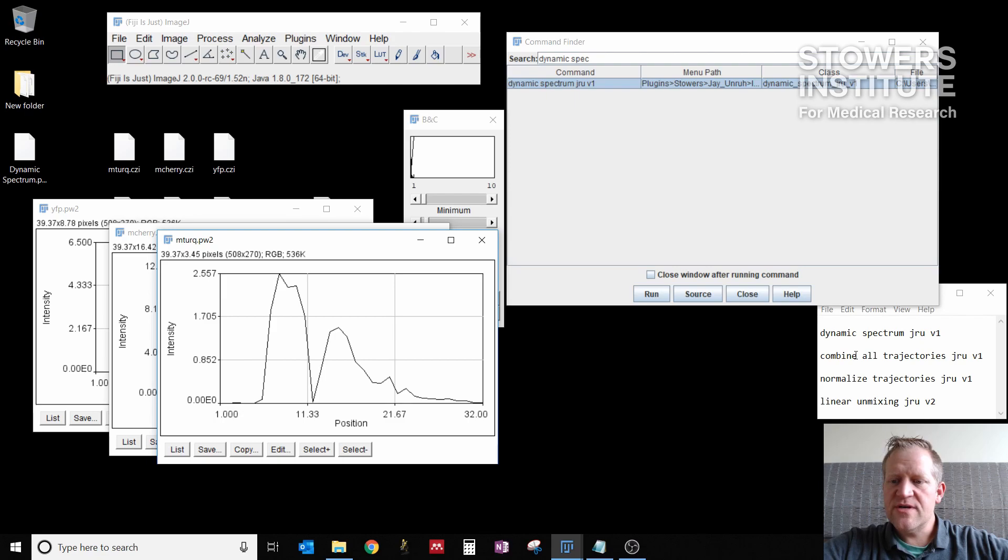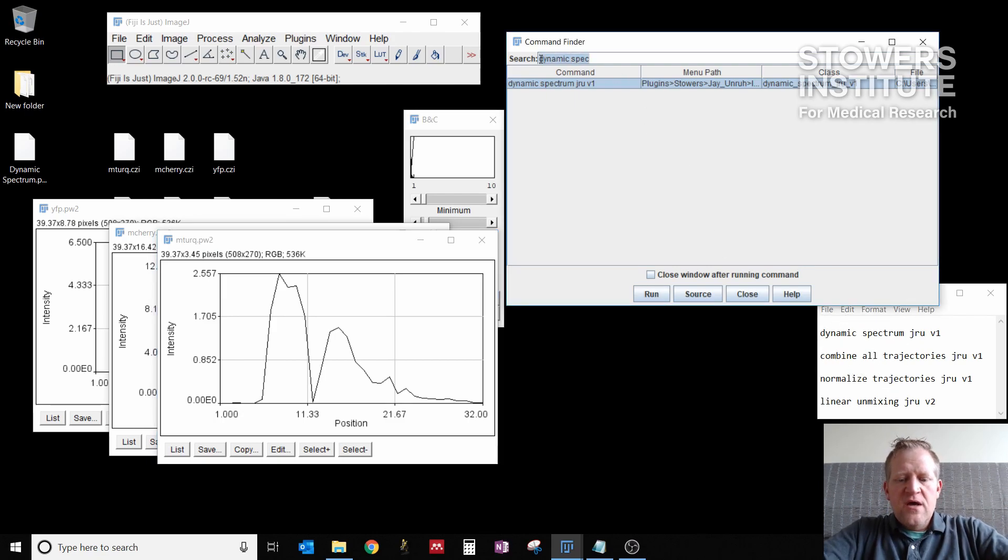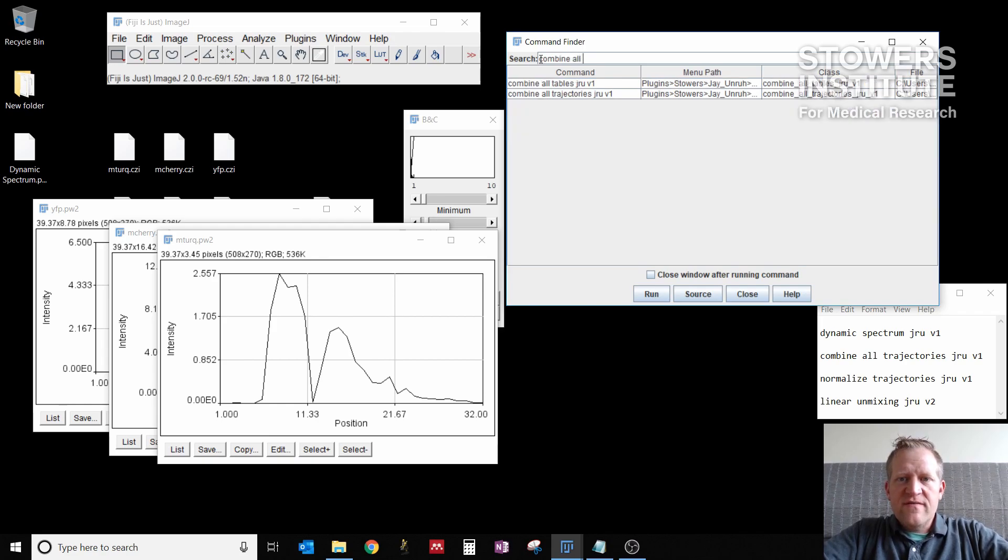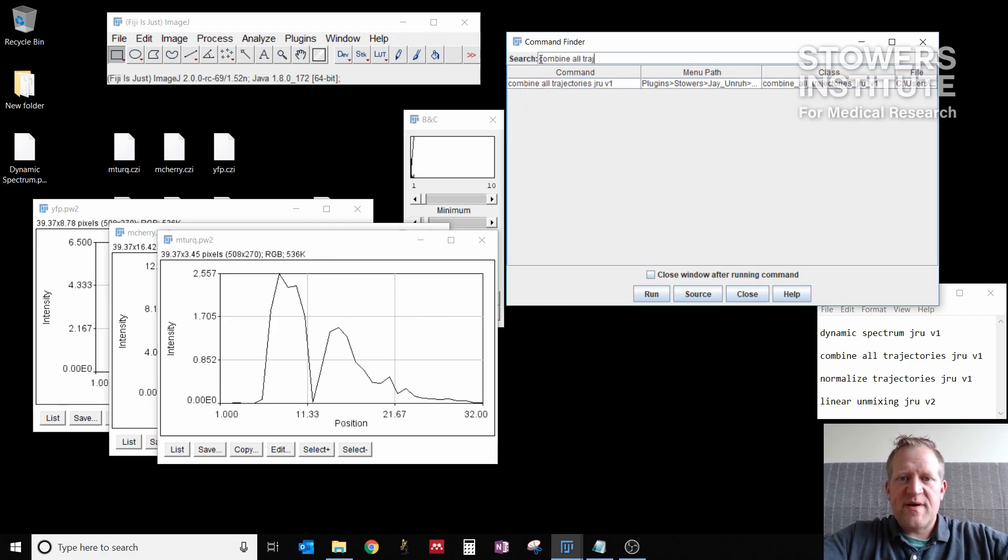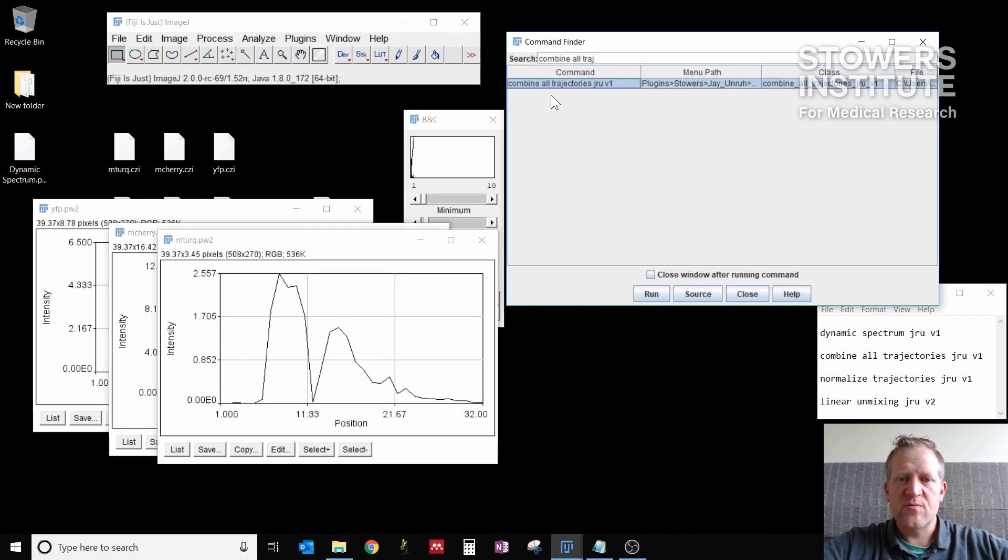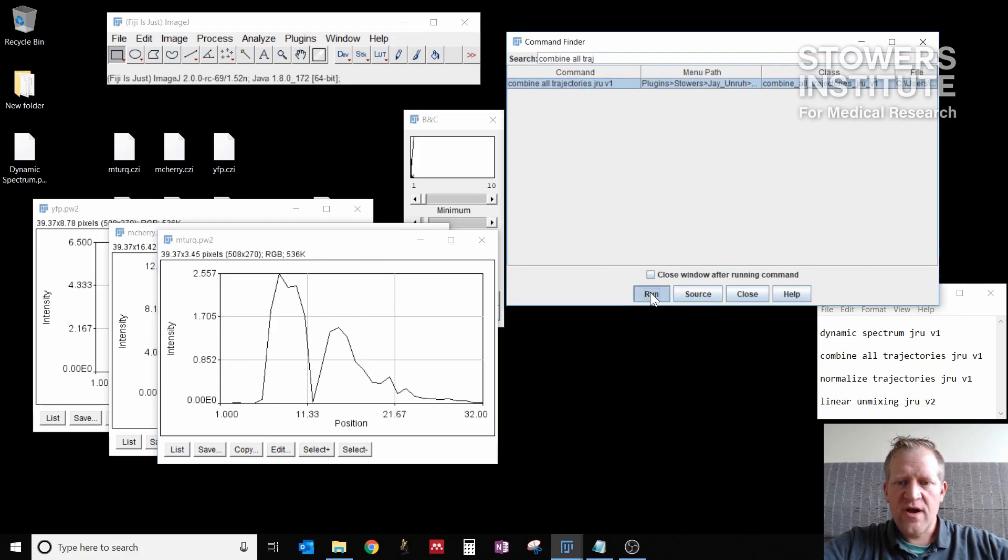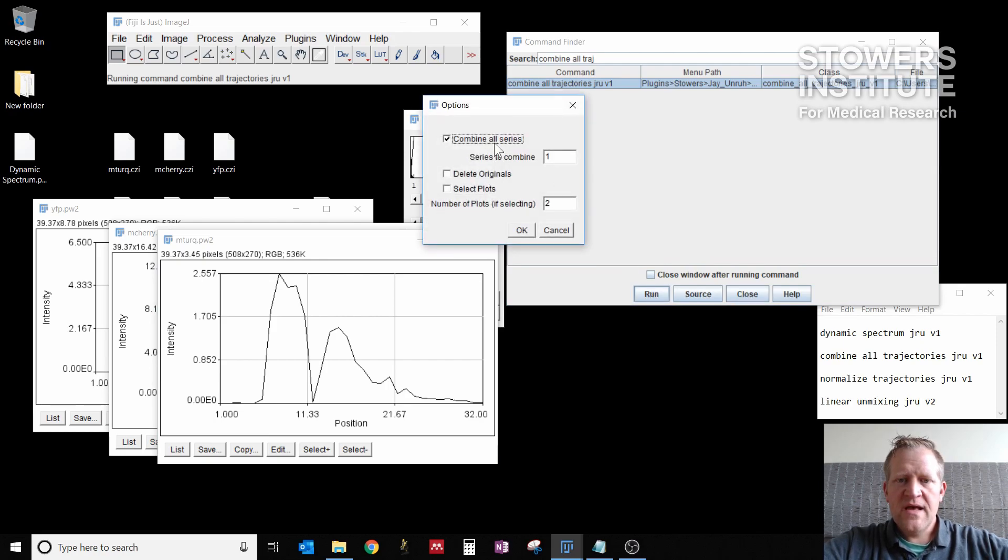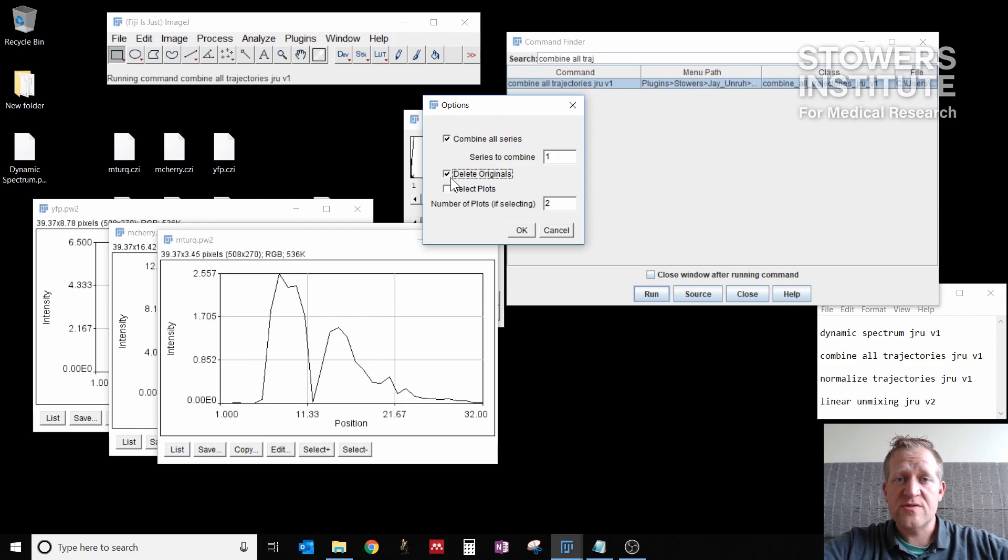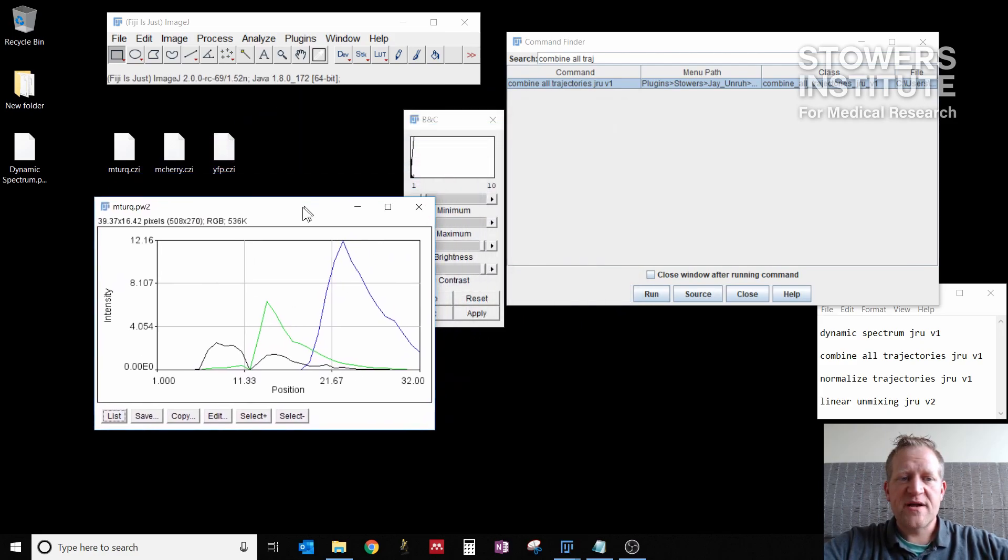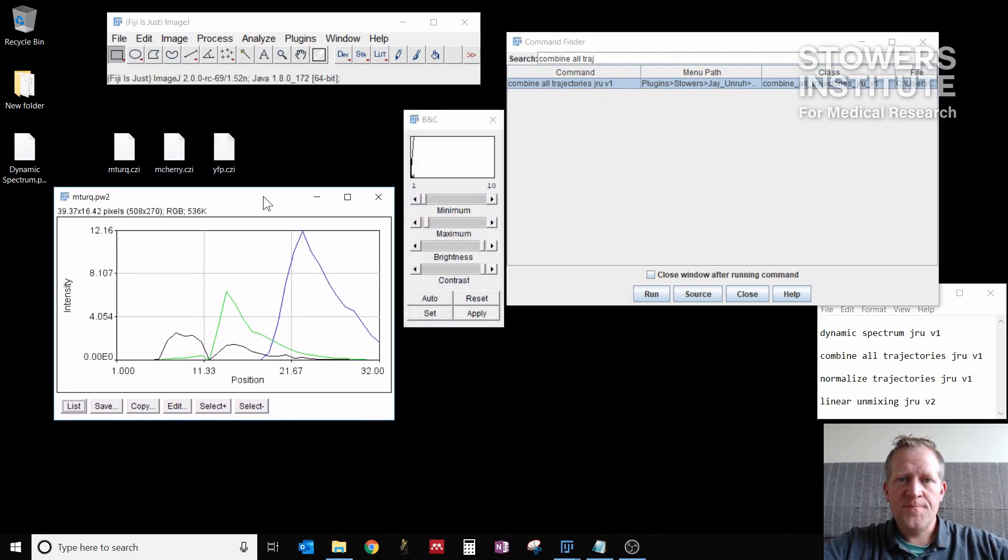So now what I want to do is combine all trajectories. This is going to combine all of these spectra into one window so that we can work with them together. So I select the plugin, I click run. I want to combine all series and I want to delete the original. So these three plot windows will go away and I'll be left with one combined window. I click OK. Now I have all three spectra in one window.